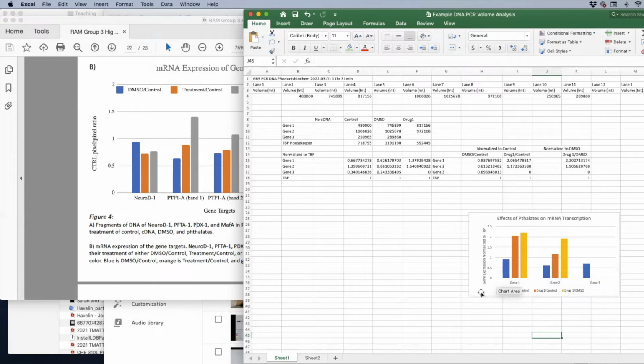They're gene ratios normalized to TBP, which is our housekeeper gene, and everything's in ratios. So there aren't technically units on it. So even over here, it says pixel to pixel ratio. If you were looking at this as units, the units would disappear. So you can label it as either. Just make sure you label it, and make sure you label it accurately. Don't put Snuffleupagus from Sesame Street over here. That's not a correct label.